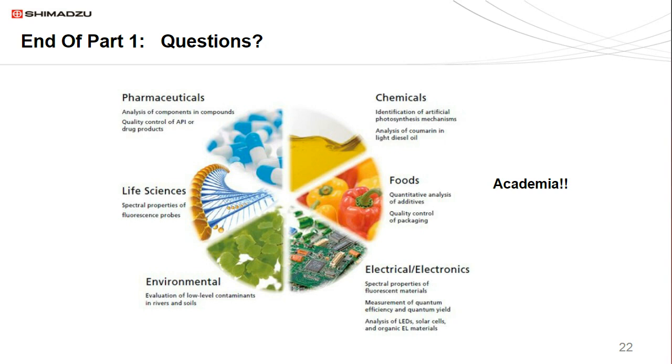Thank you. Let's do one more question before we move on to part 2. Here it is. How much of a problem is pH, and how closely do you need to control pH? It's a big problem, and you need to control it very closely depending on where you're at.